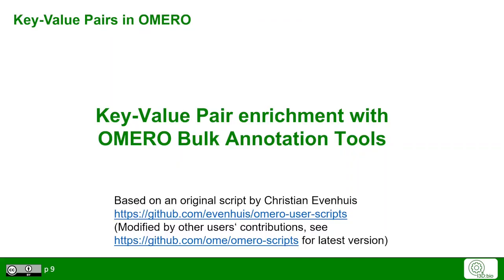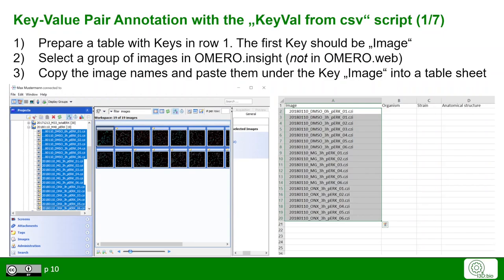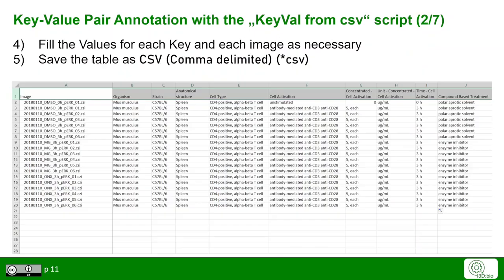Next, we focus on key-value pair annotation with the OMERO bulk annotation tools. This depends on a script originally designed by Christian Evenhus and modified by community contributions. You use a tabular format: create a table where the first row contains the keys in each column, and the first column in the first row must be labeled "image". In OMERO Insight, you can select a group of images and copy their names into the tabular format under the key image, then fill out all individual values for each image.